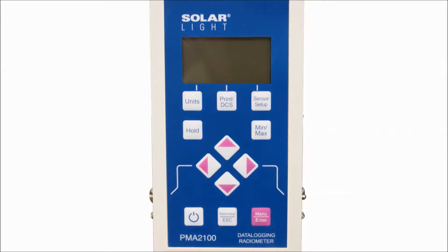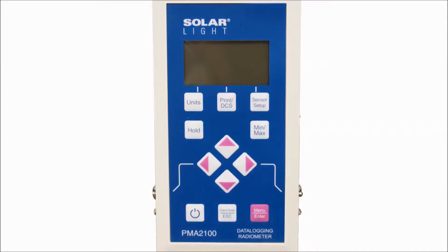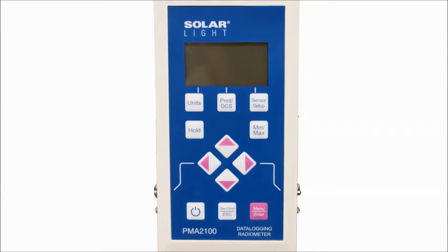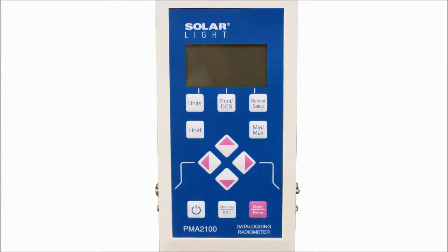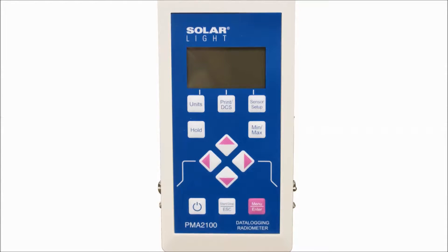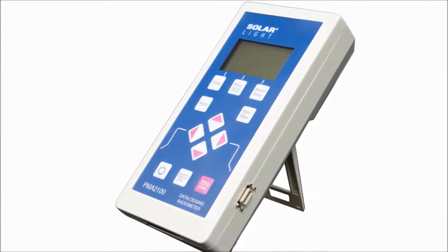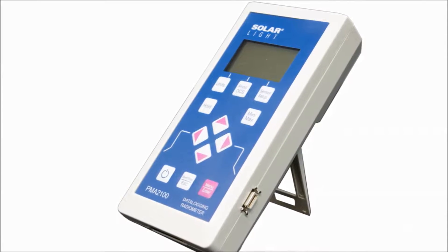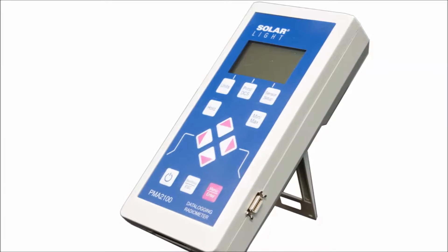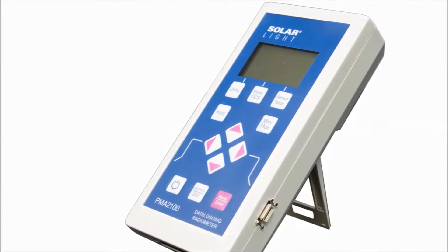The PMA2100 Data Logging Radiometer is a research-grade meter that can be used with over 35 different sensors. It functions as a light meter, photometer, and UV meter measuring UVA, UVB, UVC, visible, and infrared light. These models use intelligent sensor detection and data processing, allowing the user to add new sensors quickly and easily to measure different kinds of light without having to use a different meter.